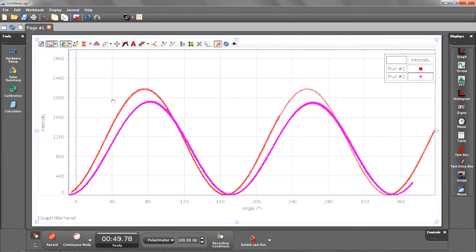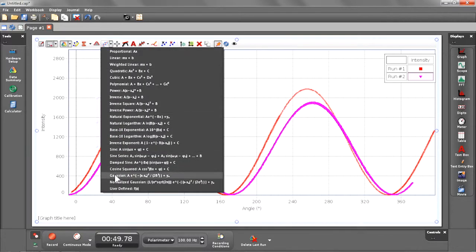So I'm going to try to find the peak intensity here and here. To do that, I'm going to highlight an area. This is my run 2. And I'm going to apply a fit to this. Apply a Gaussian fit.